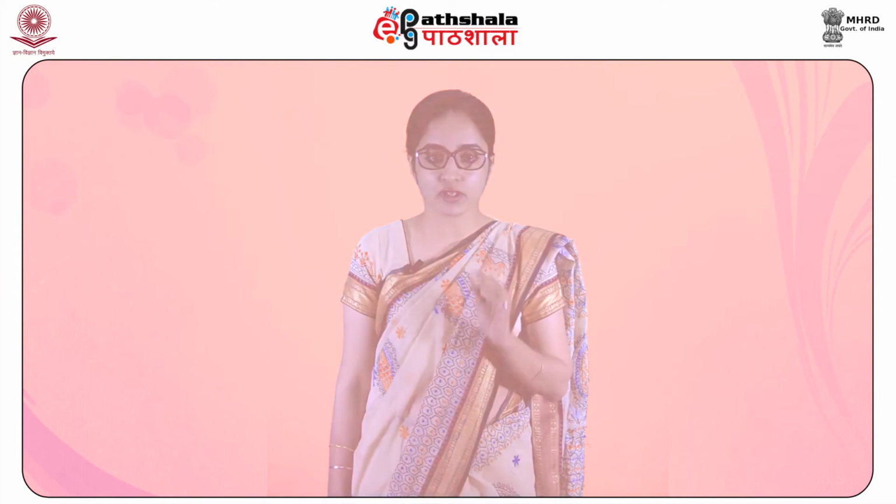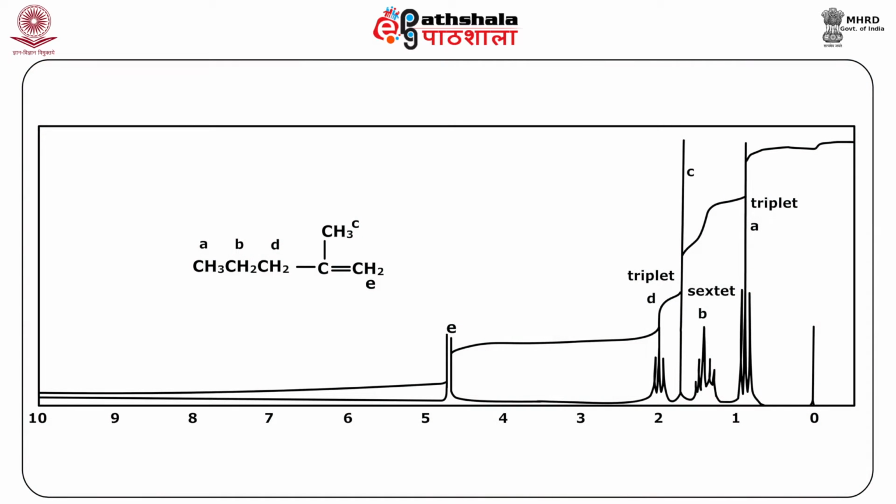If the system is conjugated, let us say of the type C double bond C, single bond C, double bond CH, the chemical shift is further moved to a more downfield region. Now in this figure, it shows the NMR spectrum, the proton spectrum of 2-methyl-1-pentene.